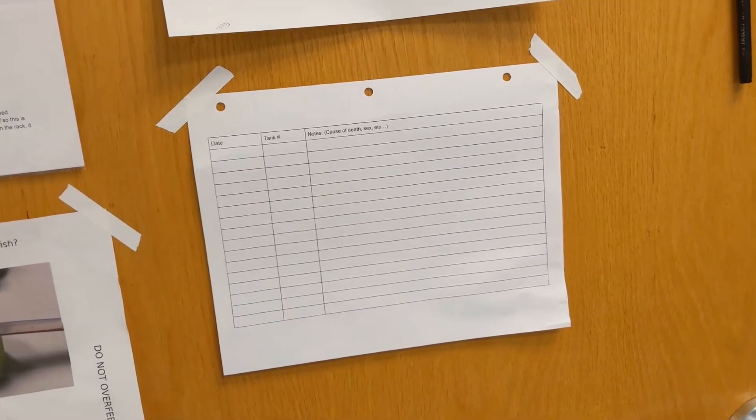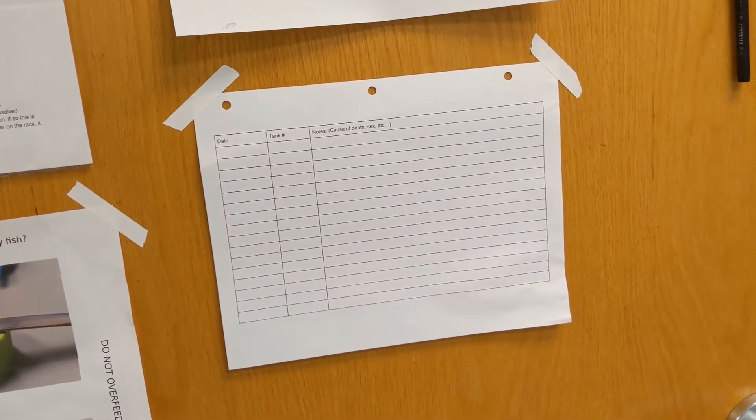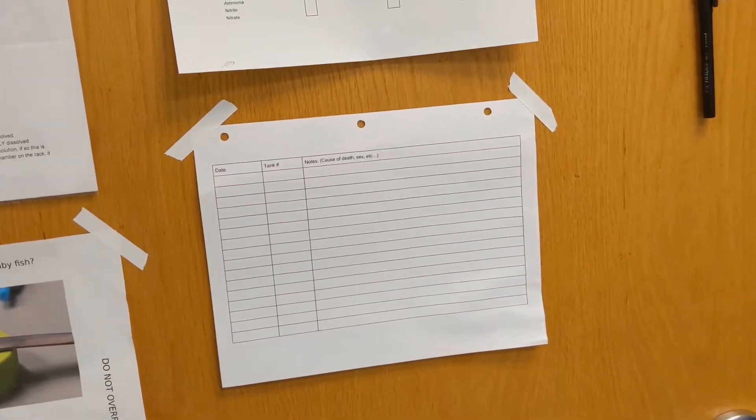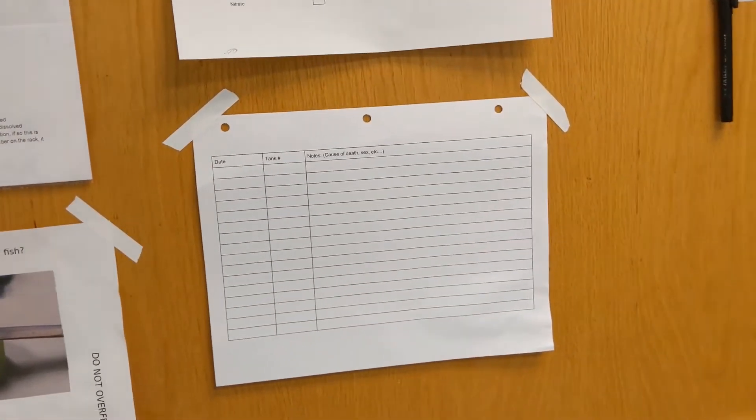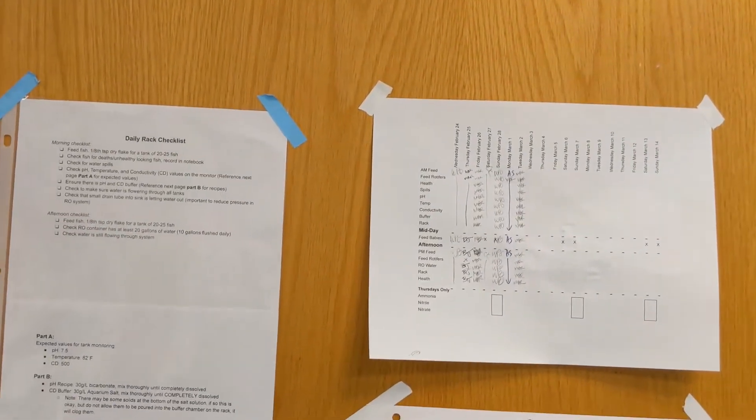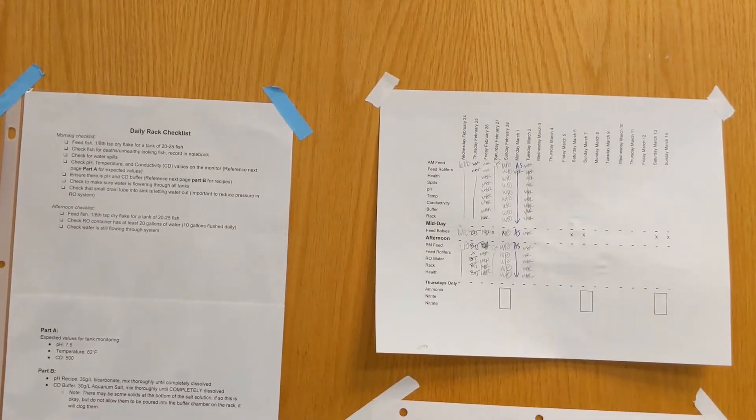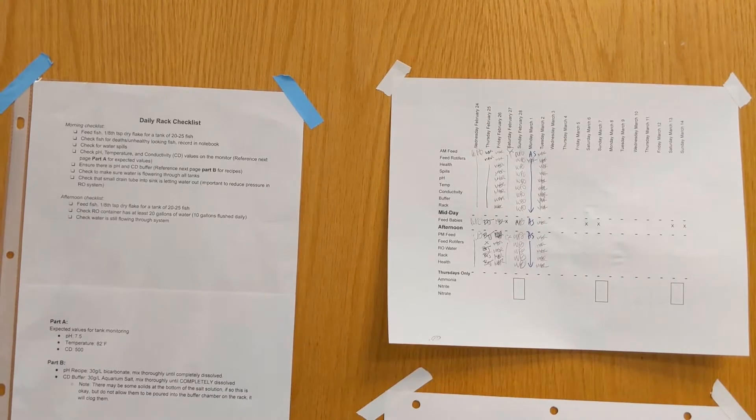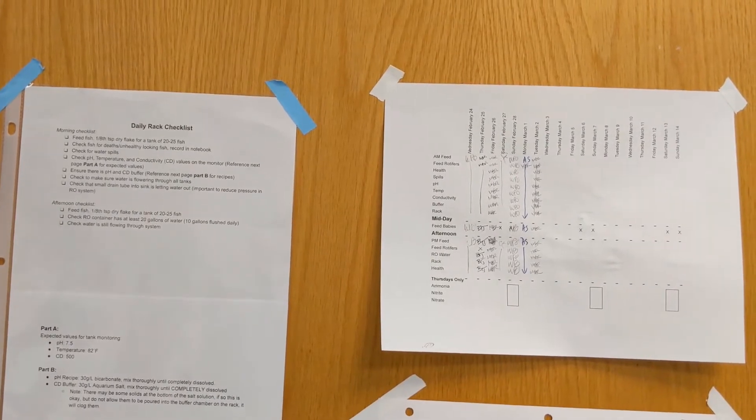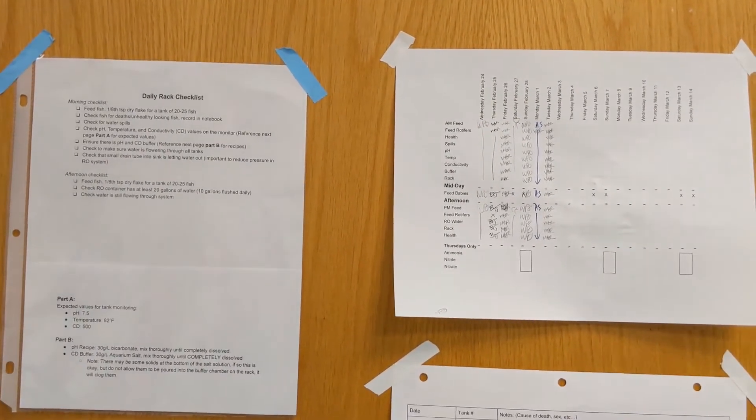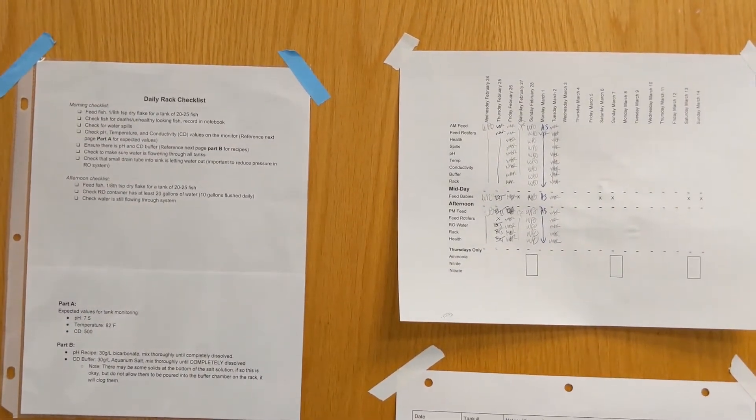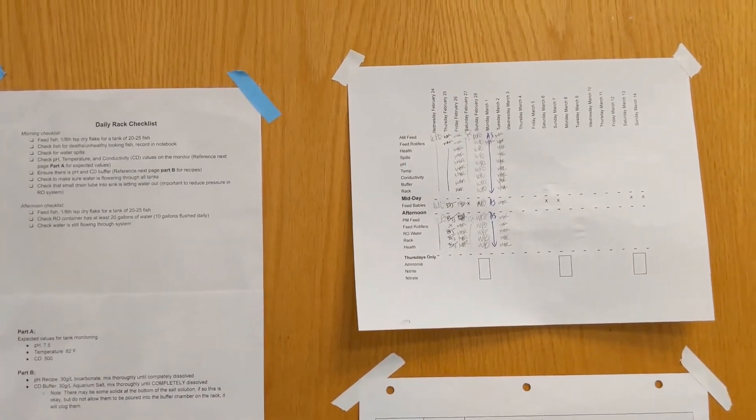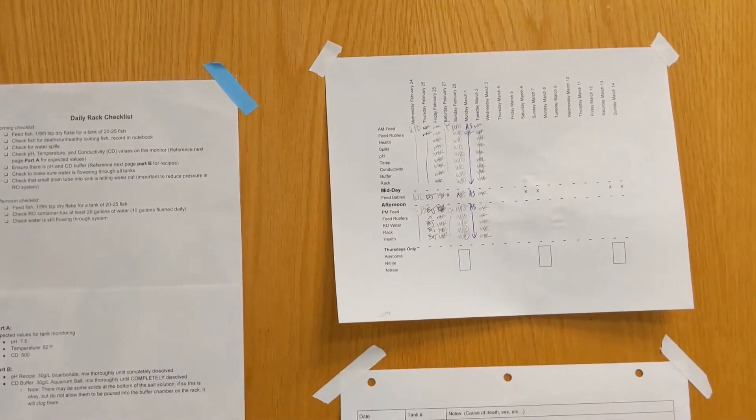This could indicate that there is some sort of issue with the rack or a pathogen or bacteria is attacking the fish. We also have a daily rack checklist to ensure that the rack is in proper working order. We first check to make sure that water is flowing to each tank and that no nozzles are clogged.